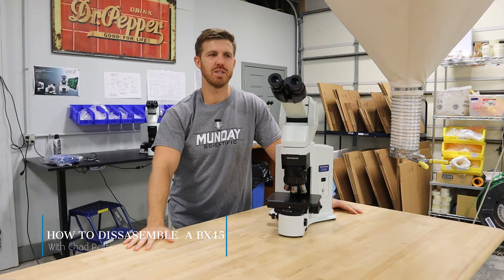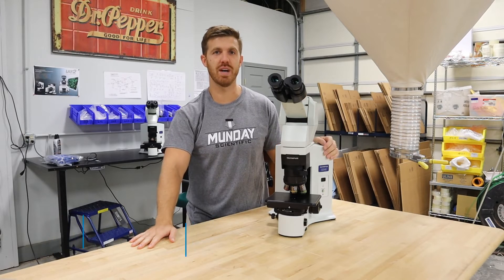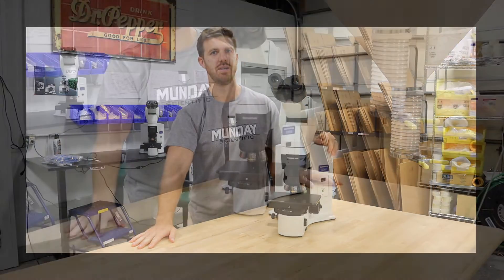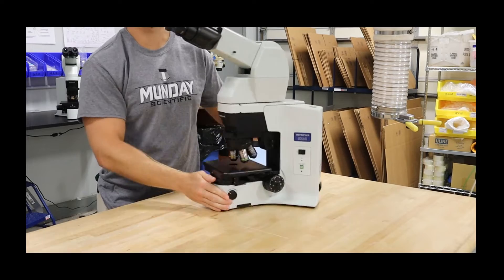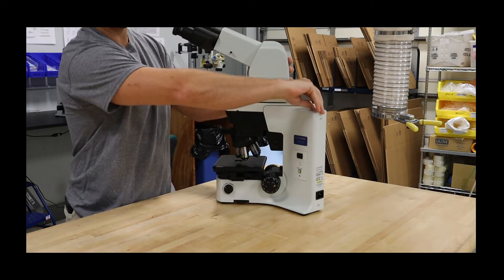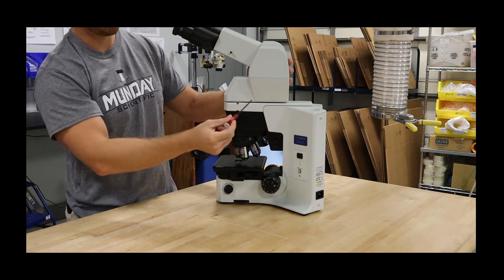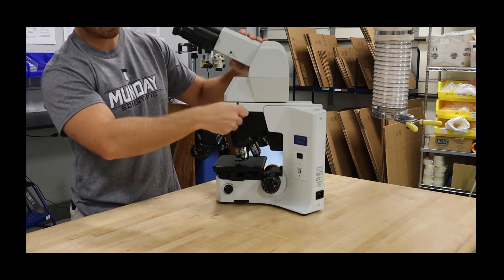This is Chad with Munday Scientific and I'm going to show you how to disassemble and assemble an Olympus BX45 microscope today. First, we've got the tilting telescoping head and we have the wrench, just like every Olympus microscope, back here in the top right hand corner. We're going to use that and take the head off.